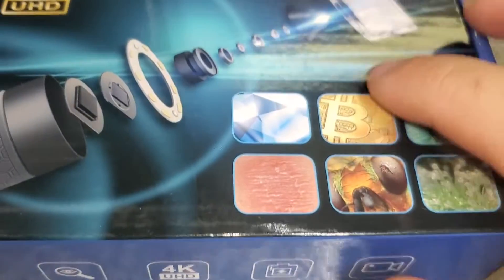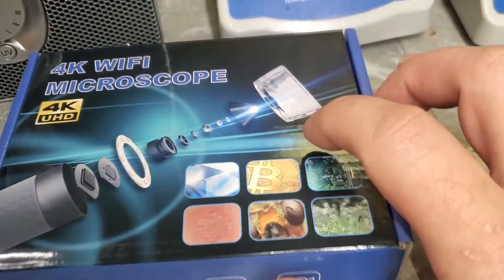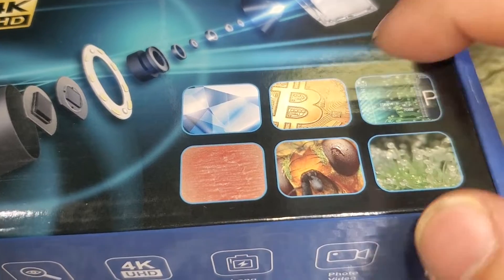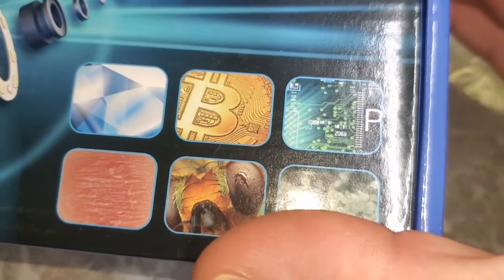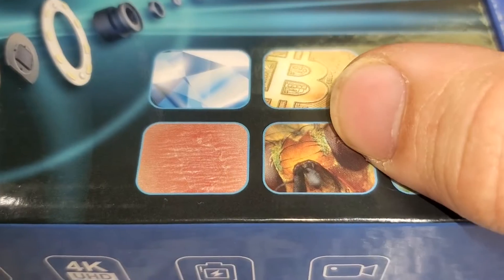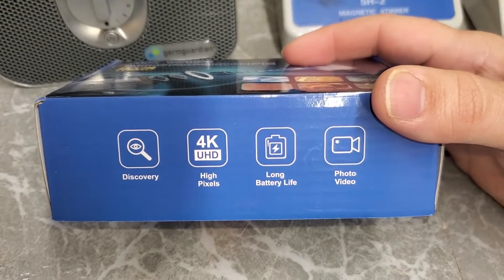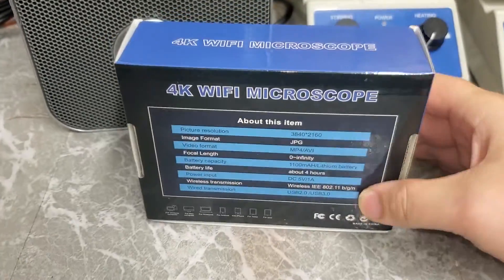Let's check out the box. It gives you a little exploded view of the different components — we're mostly interested in how this functions. They're showing use cases like diamonds or gemstones, and there's a bitcoin symbol which I really don't understand since bitcoin is electronic currency. There's a circuit board, which makes sense — you could use this for soldering. There's also what looks like a skin lesion, an insect that looks like a fruit fly head, and some plant nodules. On the side it says 'Discovery 4K UHD high pixels long battery life photo video 4K Wi-Fi microscope.'